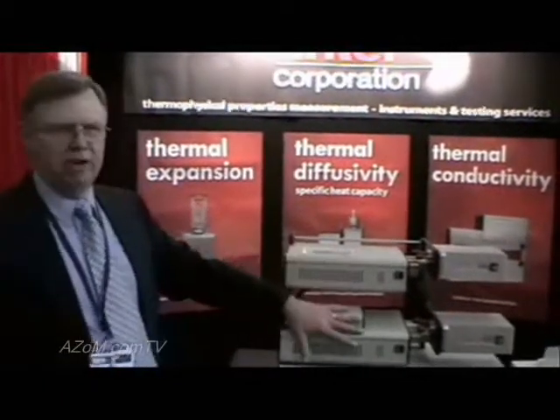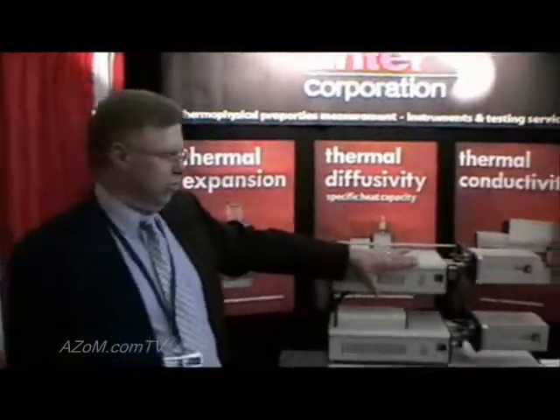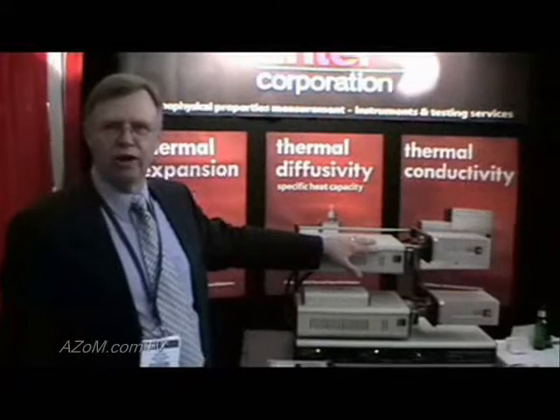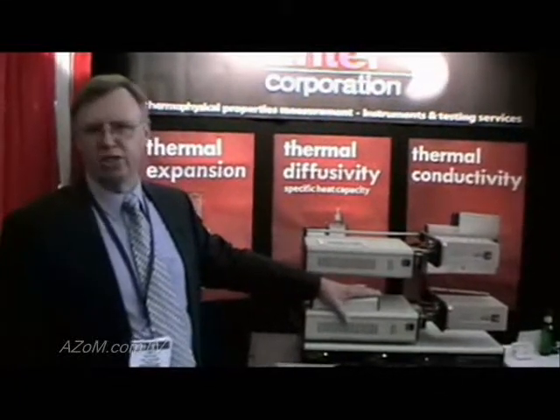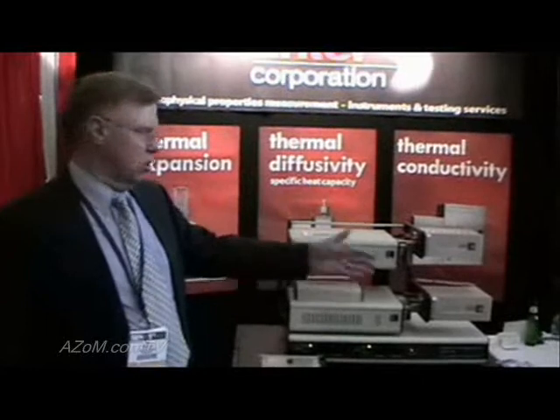This can be configured as a single furnace sample in the beginning, with additional furnaces added on later, maybe when more funds are available. We also have a high temperature furnace capability that can be combined with a cryogenic option, where we can test up to 1000°C or even higher to 1600°C temperatures with a conventional tube type furnace on the same platform. And it's all Windows driven.